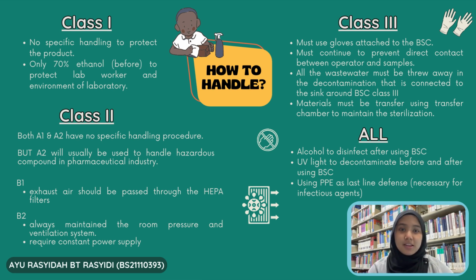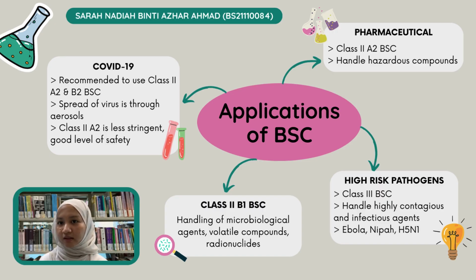In general, all BSCs must be disinfected with alcohol, and UV light must be turned on before and after the usage of the BSC. PPE will be the last line of defense as it is necessary when handling infectious agents. When applying biosafety cabinets for different purposes, it is important to select the right type of biosafety cabinet.